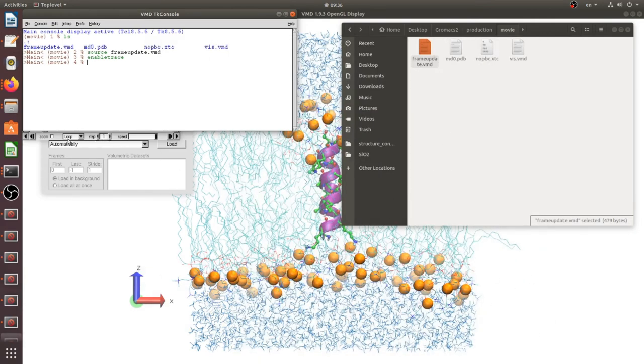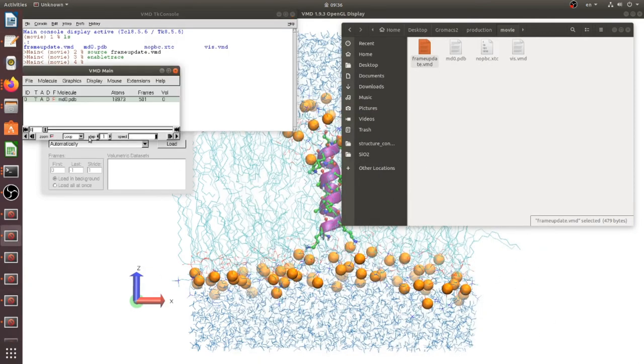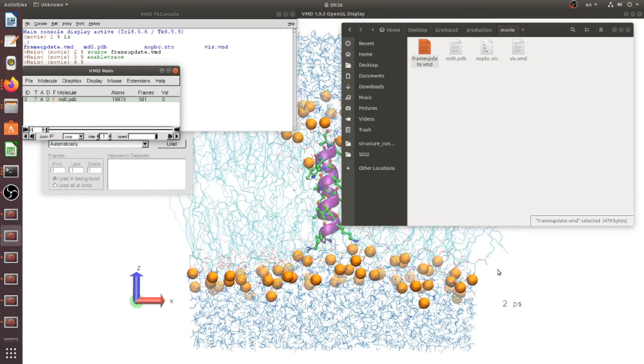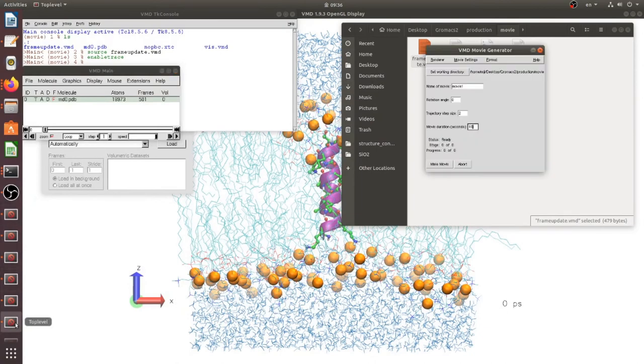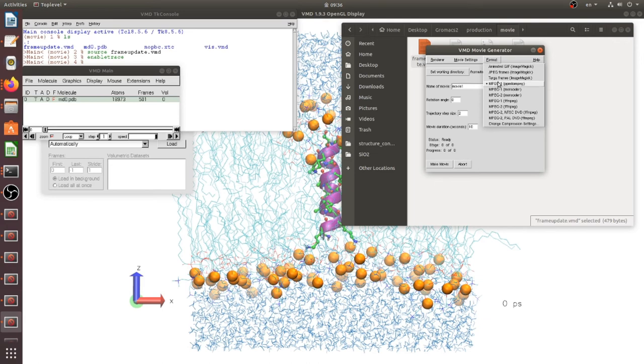We should call this function enable trace and maybe now it's working. Around here time will show, we should check. Yes, now you can change this format type.